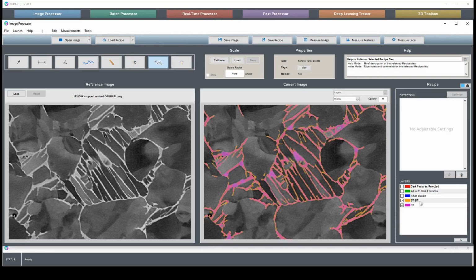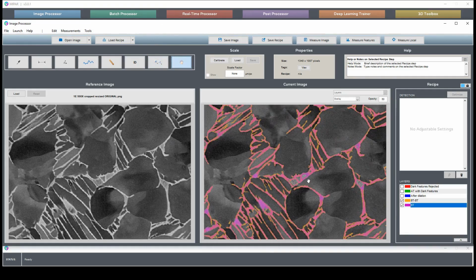We've got this first one to collect fine stuff. We've got this addition here to collect big, bright stuff. But if this recipe was more complicated and say halfway down the recipe we found another addition that happened to redo what one of these was doing, then maybe we could go back and look at the recipe and figure out how to remove some of that redundancy.